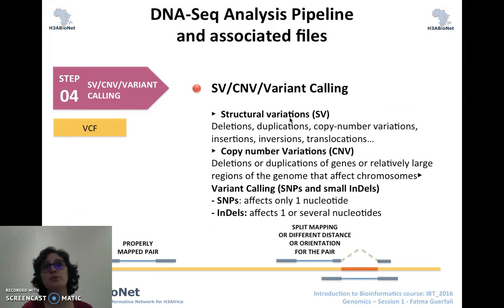So once you have your reads mapped to the genome and you would like to know where the genes are having a variant on them, you take the genes that are annotated in the genome, and then the next step is to search for the common DNA mutations that would define the changes that you have in the genome. So, for example, if you look at the structural variations, then this would include different types of variation. We will be seeing them in the next slide.